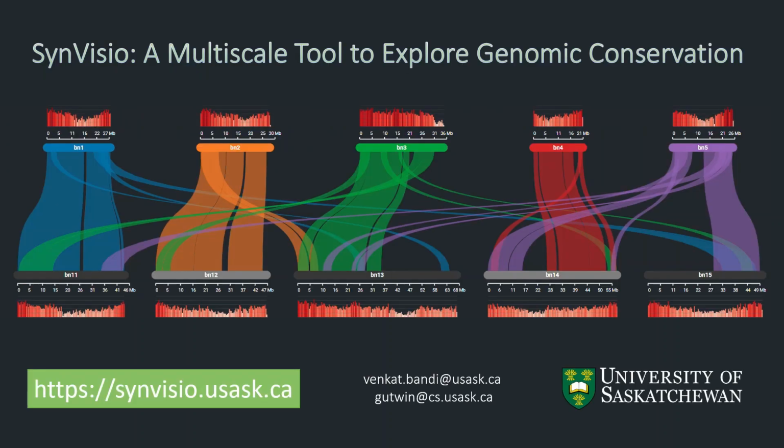To recap, our most important contribution in this research has been the design and evaluation of SynVisio, a web-based platform that lets researchers explore genomic conservation through novel interactive features. And the widespread adoption of our tool in a wide variety of research projects across the world validates our design.